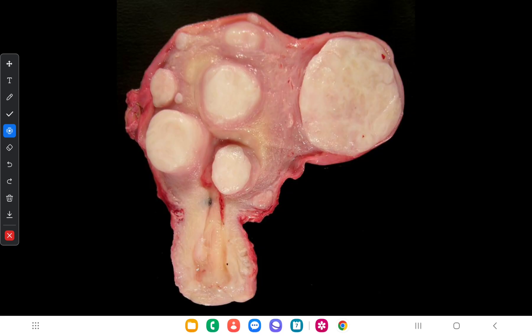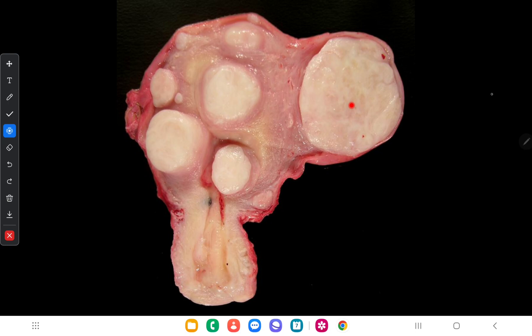Next we will talk about tumors which originate from smooth muscles. There are two types: benign tumors called leiomyoma and malignant tumors called leiomyosarcoma. The macroscopic appearance of leiomyoma shows multiple leiomyomas with no hemorrhages or necrosis. The cut surfaces are whitish in color, well circumscribed and uncapsulated, with a whorled appearance. Leiomyomas are commonly seen in the uterus.